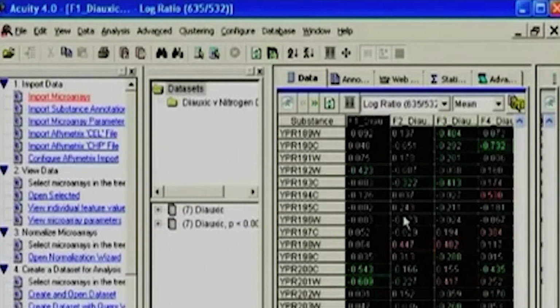Usually differential expression data is logged. The meaning of log to the base 2 is essentially that a log to the base 2 value of 1 is equal to a twofold change. So when you are talking of log to the base 2 value of 2, you are talking of a fourfold change, which really becomes significant. You can filter based on different parameters and generate the data sets. Essentially you are reducing the numbers, so you make more sense in the form of visualizations. Otherwise you can also take all the data and do it.